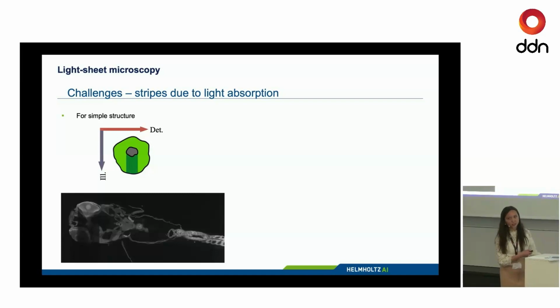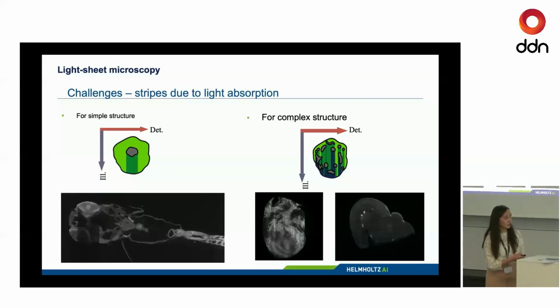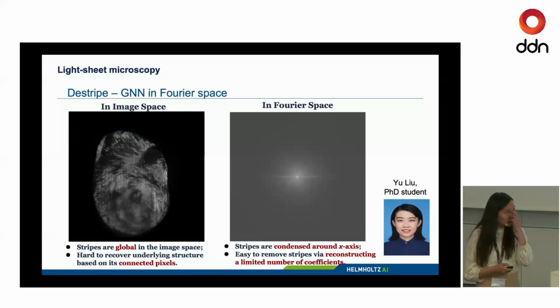So of course they do not reflect the signal. So that's actually a shadow. And in many specimens, the tissue distribution will be quite heterogeneous, so you get a lot of fine lines in your light sheet microscope. That's called stripes. So we deal with these two problems.